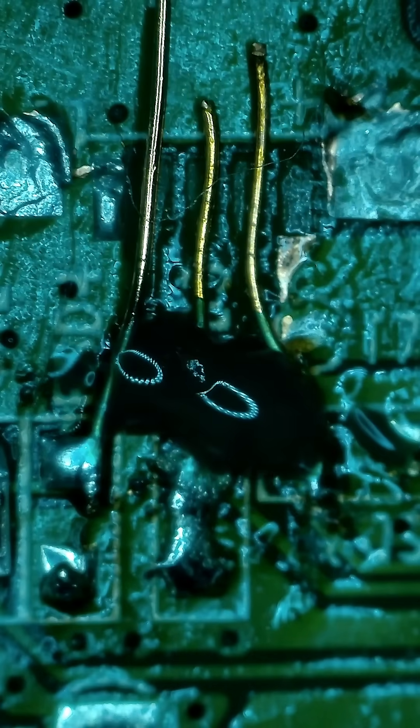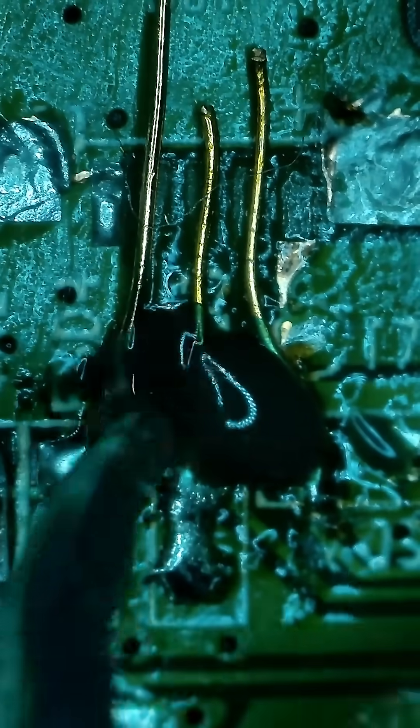After successfully adding some new traces, I went on and added some solder mask. The reason is that these wires may not seem like it, but they're really tiny, and the solder mask keeps the wires from desoldering themselves when I try to solder them to the USB port later.